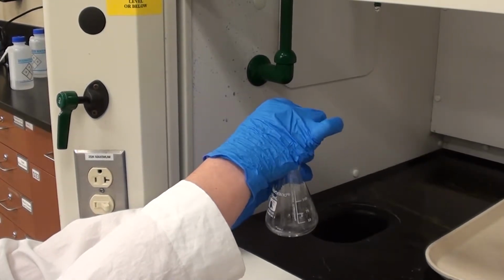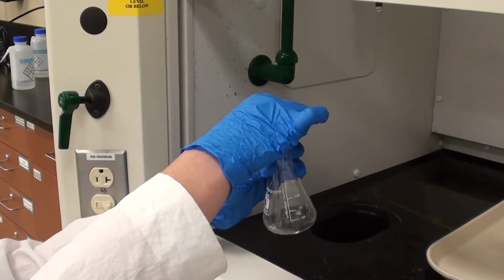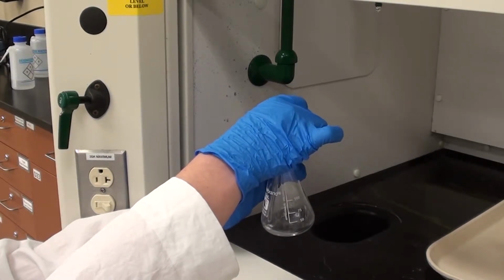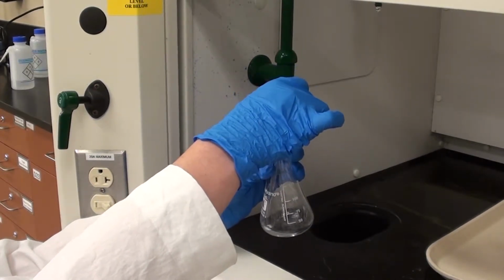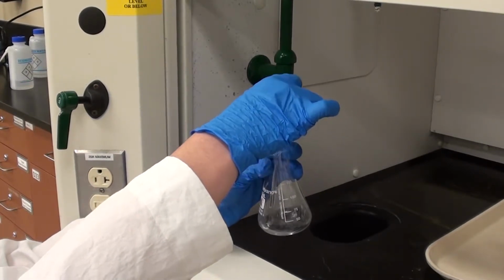Now one other technique that she's going to use here, she's going to take bits of the solution and put them on the side of the flask, just to kind of help aid in crystallization. So she's just kind of, yeah, there we go.